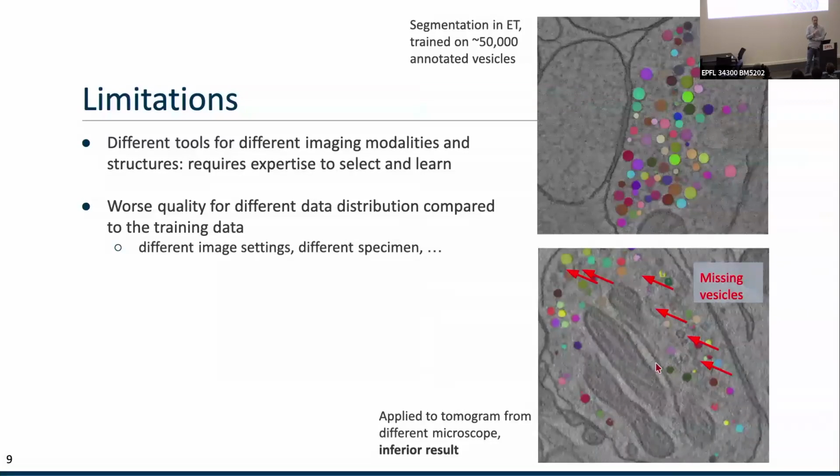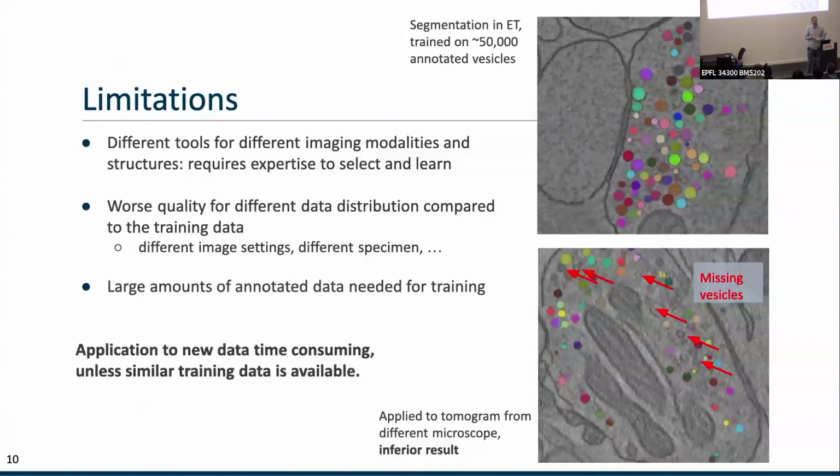So it finds some, but it does a much worse job. Although, as a human, it would be very easy for us to translate from one setting to another. The networks can't really do this, at least when they're trained on a small data set, or a data set of only very similar images, so their generalization is limited.